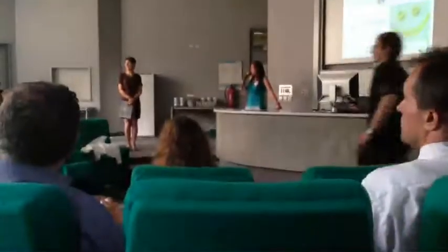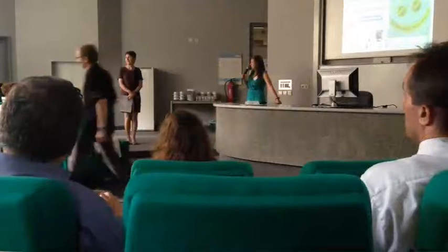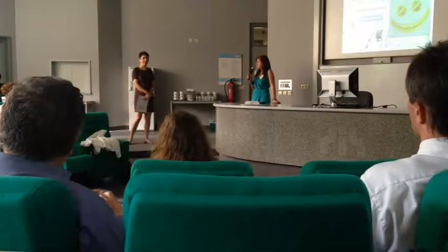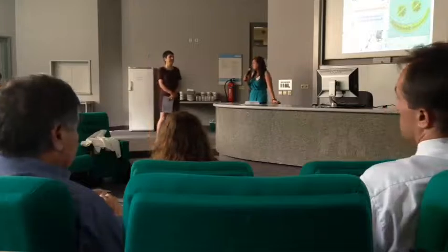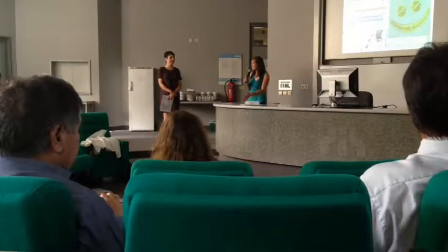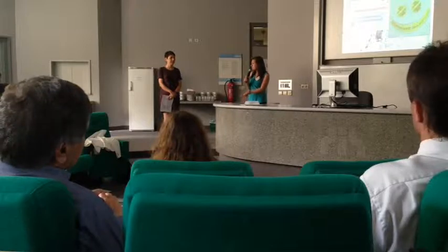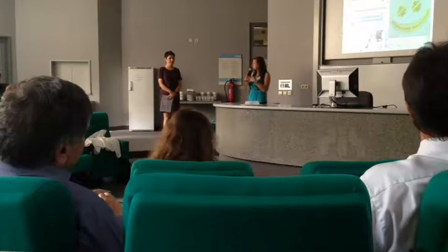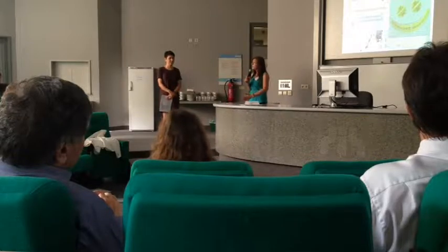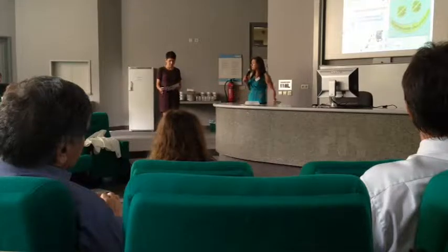You put the effluent with the nitrogen and you stop. Yeah, you can. Basically, we can program this, if it's possible to do, because we closely monitor the nutrient concentration inside the cultivation system and the biomass. So we just basically started to focus on it quite a lot. So we know at exactly which stage we should stop to produce lipid-rich biomass.